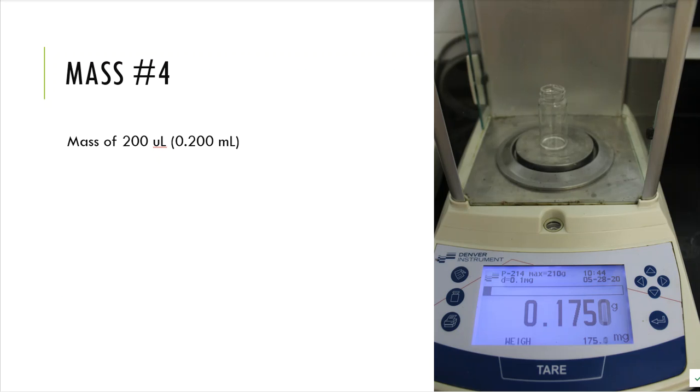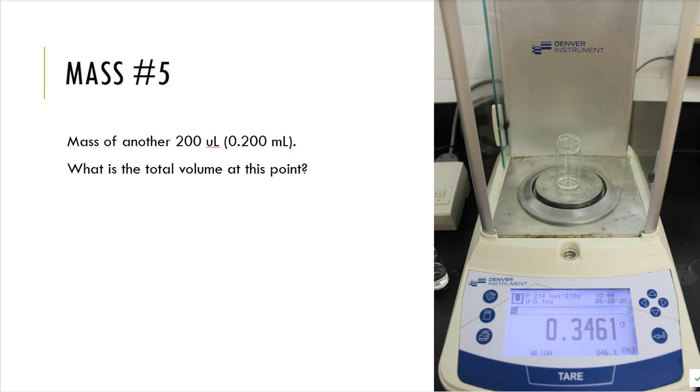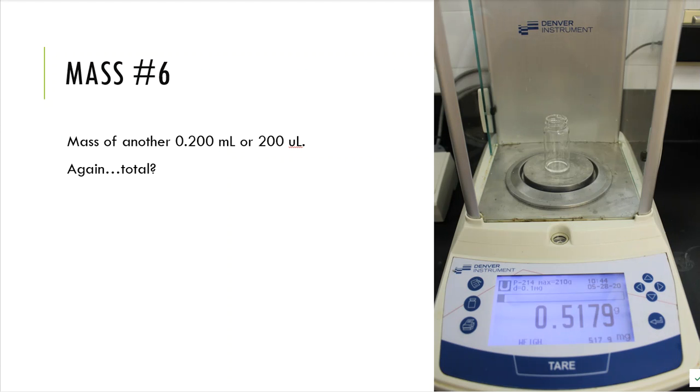So there's my first addition, and my first addition is 0.2 mL. All right, so then I did it again, and I put another 0.2 mL in. So you've got to add those together to get a total volume. And the total at that point, which was 0.4, was 0.3461 gram. All right, then I did it again. I added another 0.2 mL. So now 0.2 and 0.2, and now my third 0.2 is 0.6. So 0.6 mL has a mass of 0.5179.